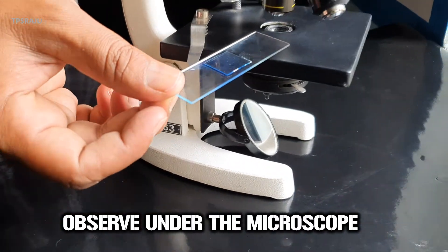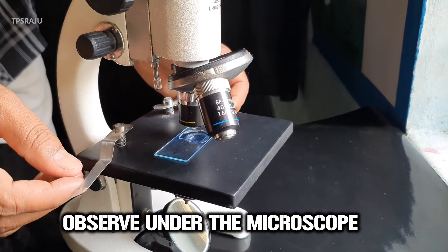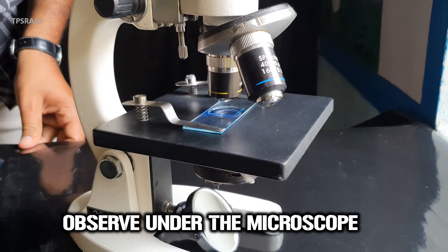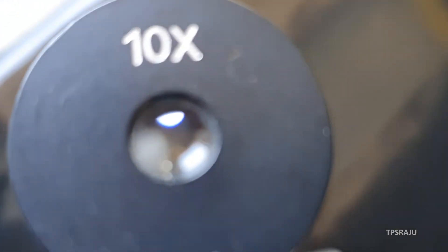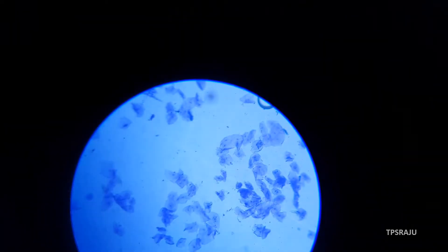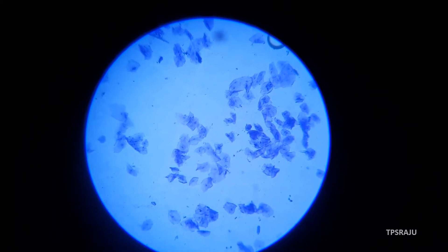And observe under the microscope. Observe carefully. Now we are going to observe the cheek cells under the microscope. Yes, these are the cheek cells.